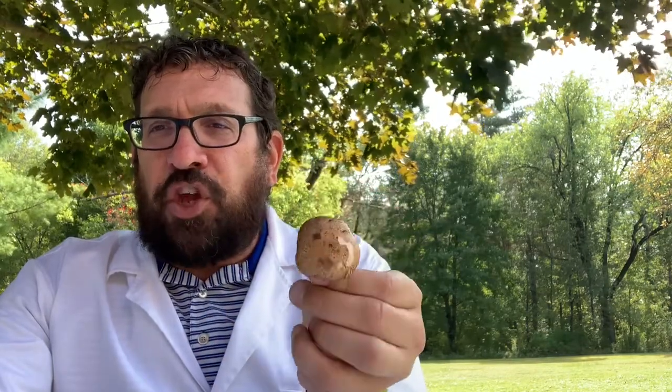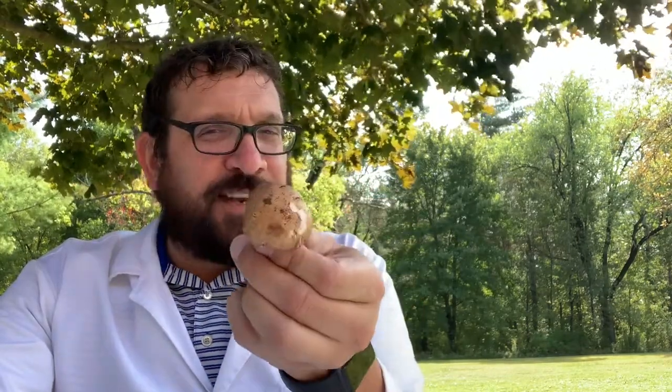All right, I'm sitting out here outside the lab right now to discuss what our first dissection lab is going to be. And we're going to really take a look at the fungi kingdom and some mushrooms that I have procured from, that's right, Giant Eagle. So yeah, I got some portobello mushrooms from Giant Eagle, and we're going to take a look at these. We're going to take them apart.